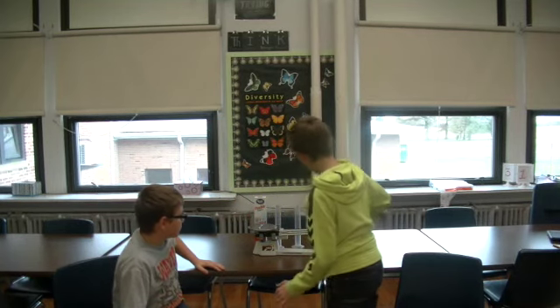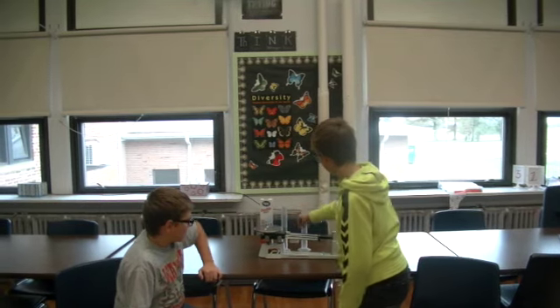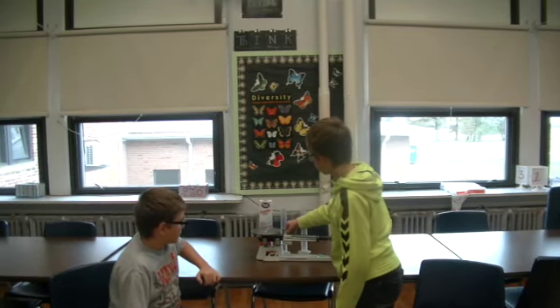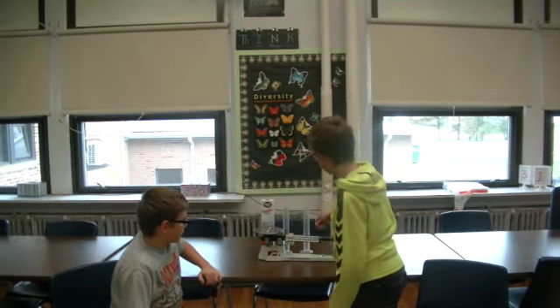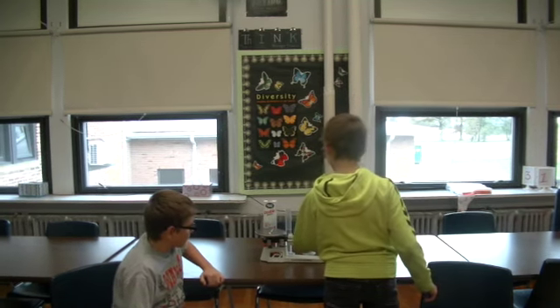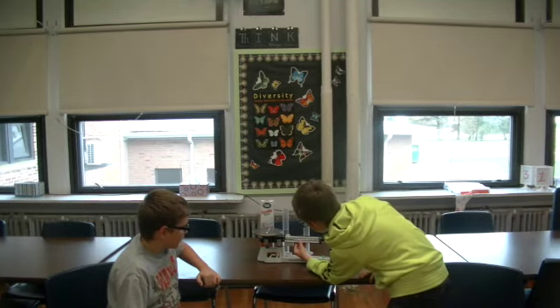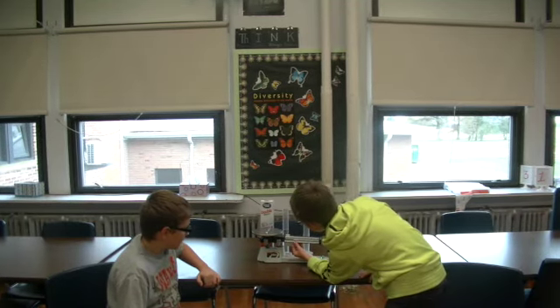Okay, so too light, obviously. Let's go to the hundreds. Obviously, it doesn't weigh 100 grams. Tenths, obviously, doesn't weigh at least 10 grams. So let's go to the ones. Since we know it's not 10, let's go to 5. Looks like 5 is just too heavy. So let's go to 3 maybe.